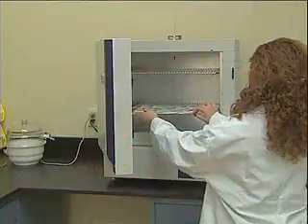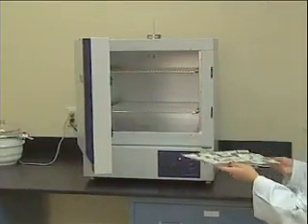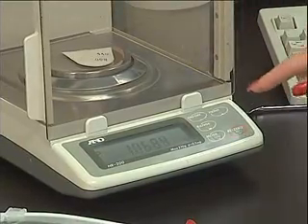When the process is complete, the samples are dried and re-weighed to determine the fiber value. It's that simple.